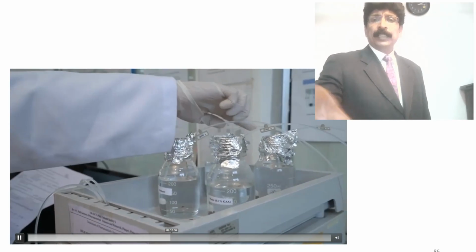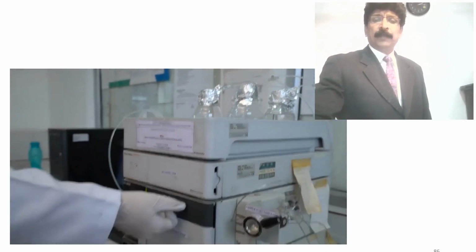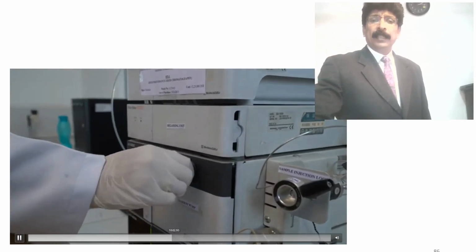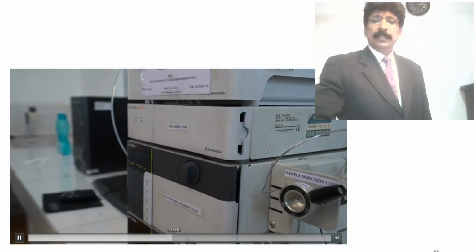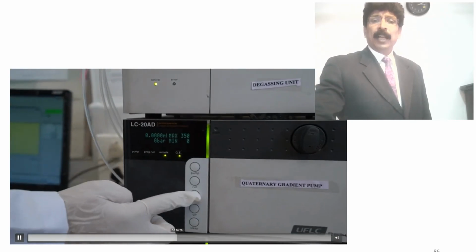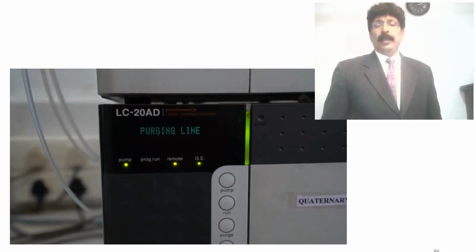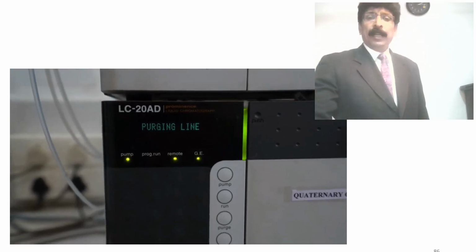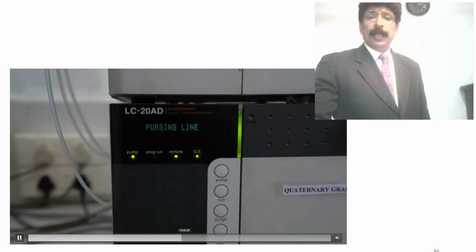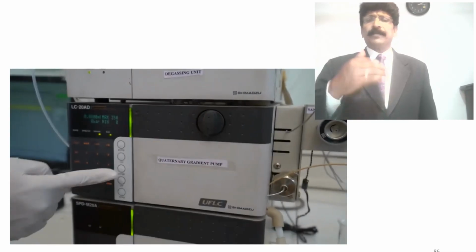There are 4 solvent lines, but only the back 2 she is using for this experiment. Then she is turning it on and starting the purging operation. The purging line removes all the air or trapped air and gives smooth running.